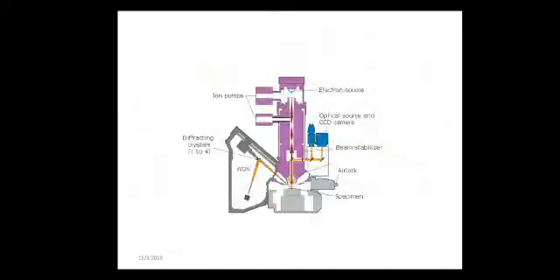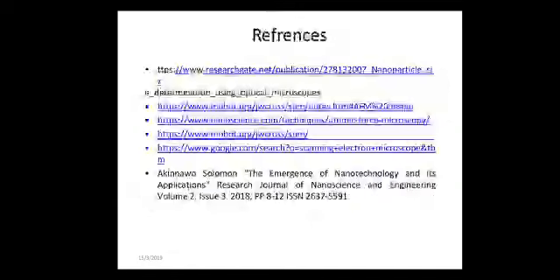Some disadvantages we have under the electron probe microanalyzer are that it is unable to detect the lightest elements like helium, lithium, etc. And electron probe analysis also cannot distinguish between the different valence states of iron. So these are some disadvantages of the electron probe microanalyzer.